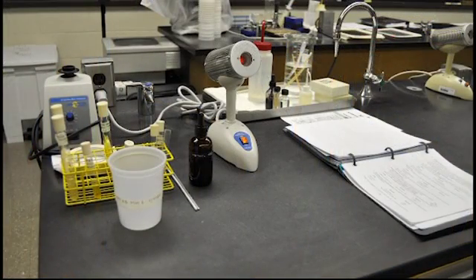Rule number 7. This rule states that you must keep your work area neat and organized. Place your incinerator directly in front of you and keep this space clear of all notes or books. Your lab manual should be placed on your right side if you're right-handed. As a general rule, never work over your notebook.